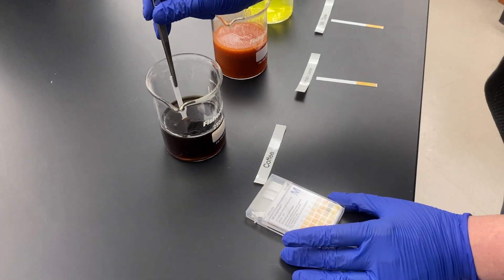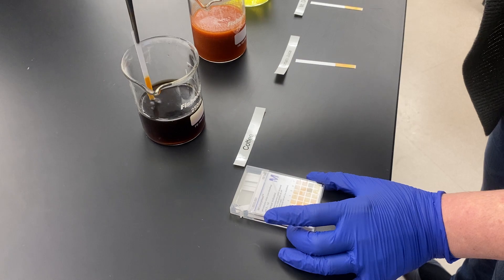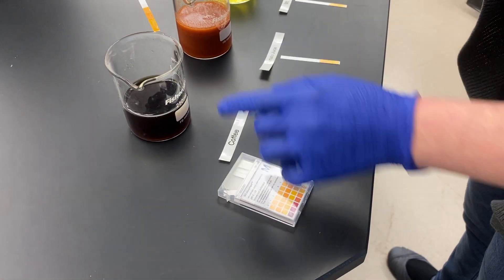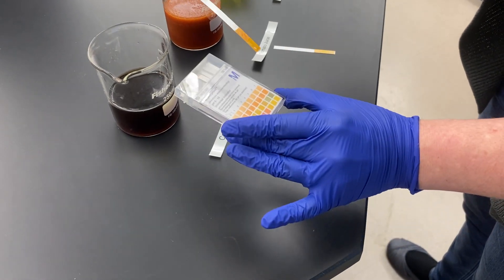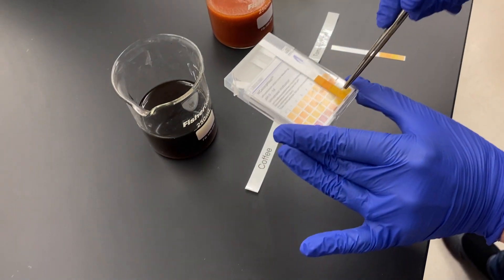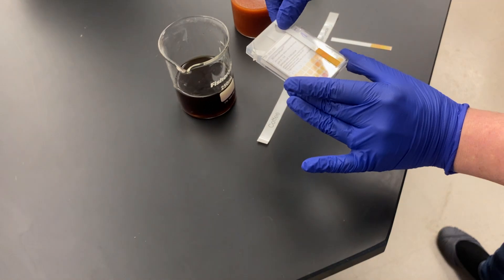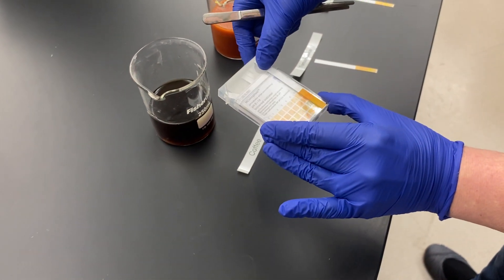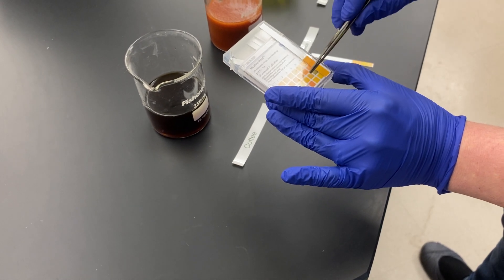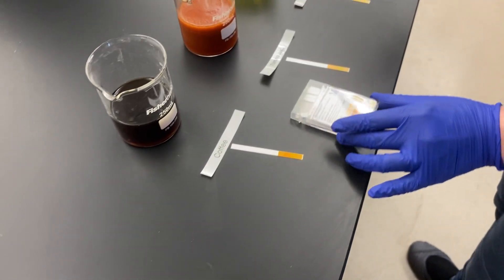I'm going to make sure the strip is fully submerged in each solution. Starting with coffee — you can see it's a little hard to read since it colorizes based on the color of the material, but comparing it to our sample chart, coffee is most likely close to a pH of 5. It's not quite dark enough to be a pH of 6 and it's definitely not a pH of 4, so we would say coffee is pH 5.